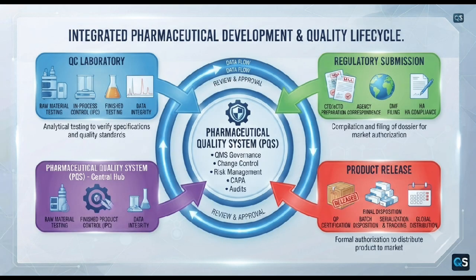Regulatory compliance. Residual solvent testing is an important component of pharmaceutical quality control. Manufacturers must establish appropriate controls based on the manufacturing process, toxicological risk, applicable specification, and relevant regulatory requirements. The analytical procedure, acceptance criteria, calculations, chromatograms, system suitability data, and results should be properly documented and traceable.